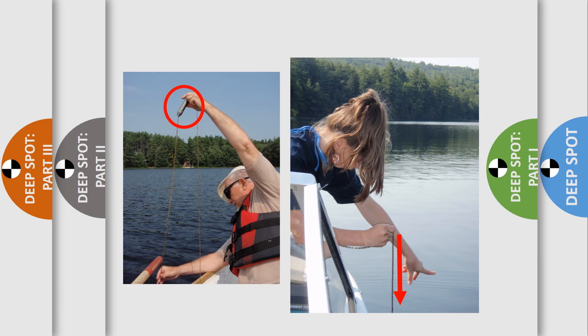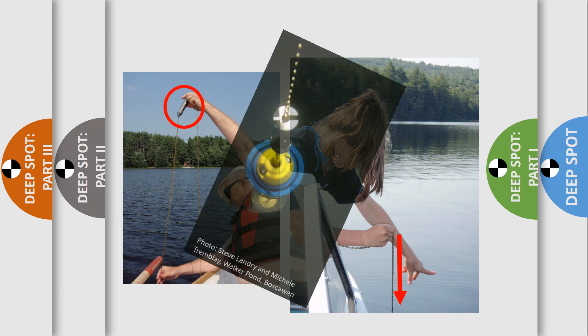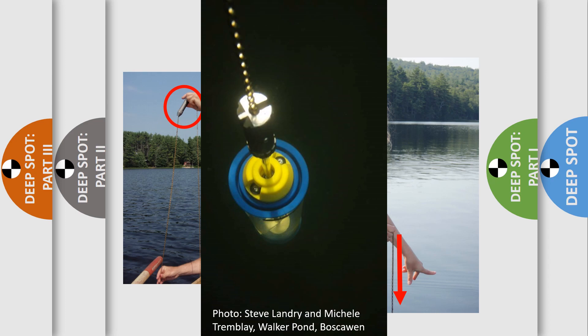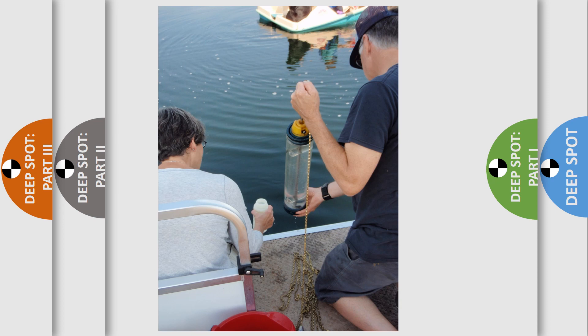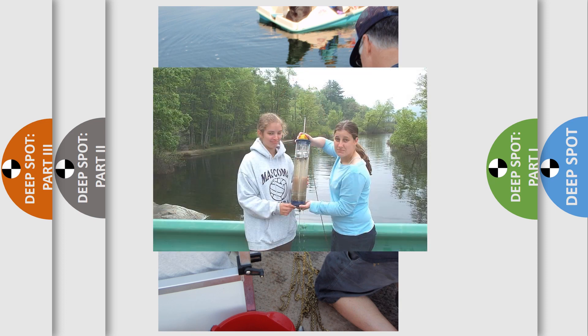Then send the messenger down the chain to close the bottle. Once closed, pull the bottle up through the water column. When it reaches the surface, grab the Kemmerer bottle by the rod to lift it out of the water. Then support the bottle on the bottom so it doesn't open up. Remember to check for any sediment in the bottle. If you observe sediment, start over. Sample at a slightly shallower depth or wait for the lake bottom sediment to settle out.